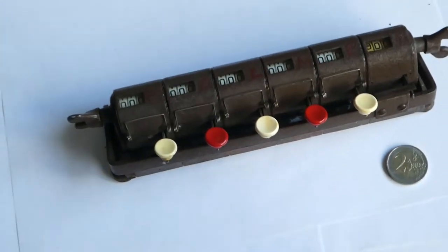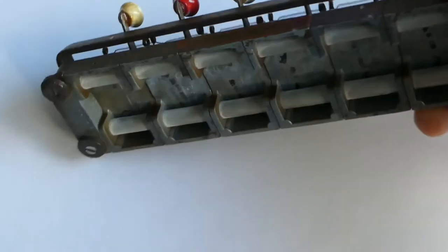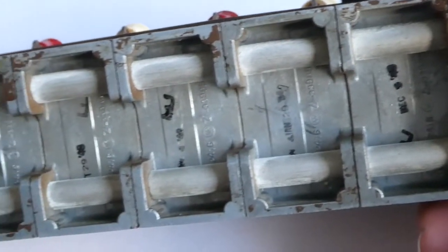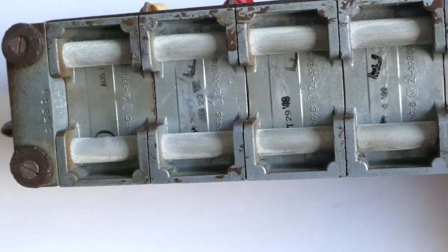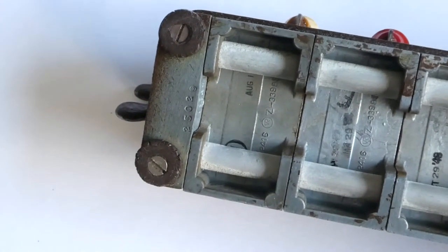This machine was made in 1948. On the bottom each of the units has a date stamped on it, and the most legible one says 1948. There's a serial number at the end there.